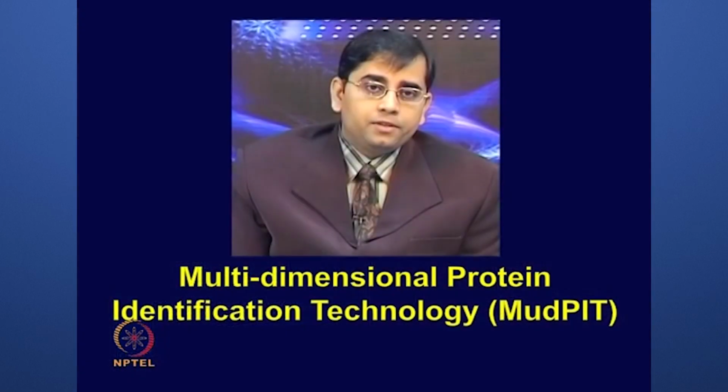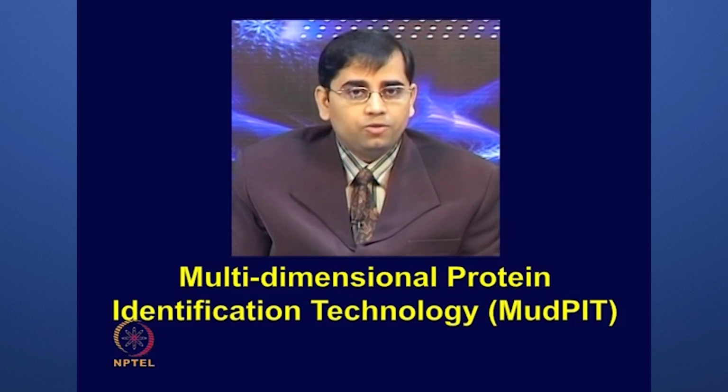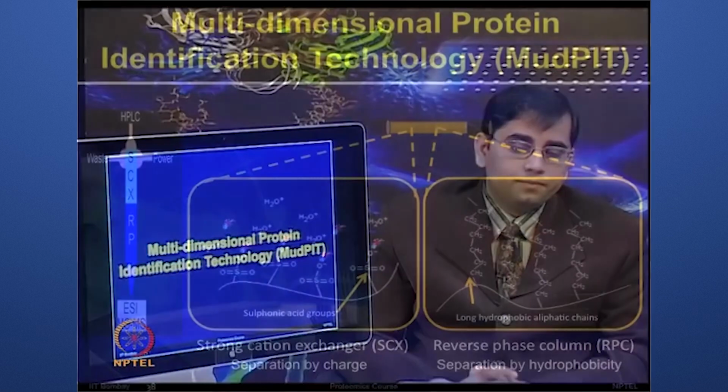So, what is MudPIT, or multidimensional protein identification technology? The MudPIT method combines cation exchange and reverse phase HPLC chromatographic separation of tryptic peptides for proteome based analysis.